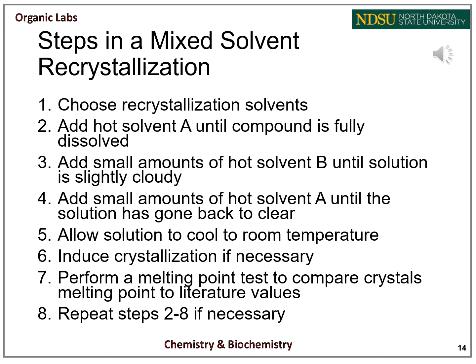As you can see, the steps in a mixed solvent recrystallization are very similar to a single solvent recrystallization. We still remove impurities, induce crystallization, and perform melting point analysis in the same ways as a single solvent recrystallization. The major differences in a mixed solvent recrystallization are how the solvents are chosen and how the solvents are added, and that's what we'll be going over in the next couple slides.